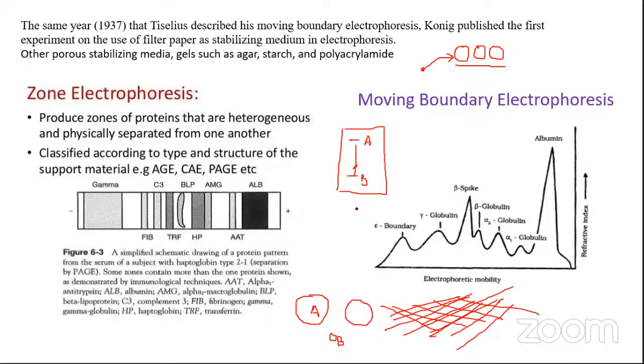What's the chance? Do you believe that there is a greater chance? There is a greater chance for B to get diffused. Yes, A won't, but B still needs to move a greater distance to get mixed up with A, compared to A, which will never move, because it is already pushed through the small pore size gel.